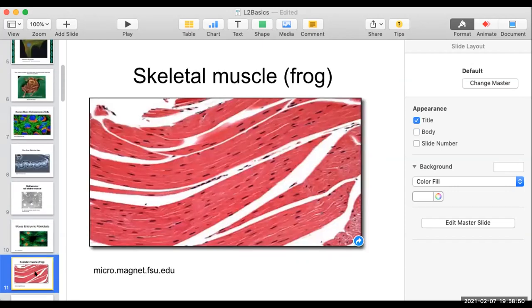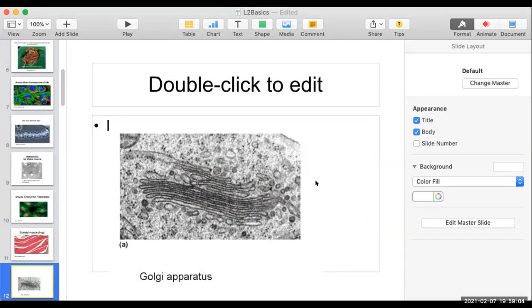And how about this? Some beautiful bright field. This is H&E stain, made by a histologist — a beautiful slide.